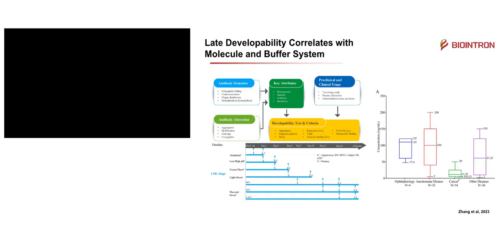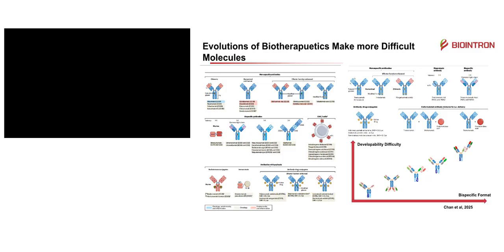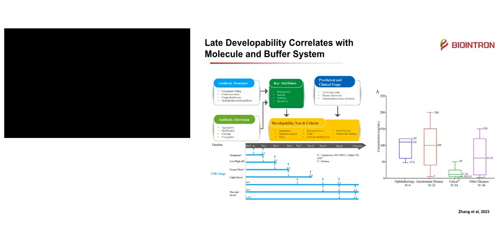That will be a simulation of the transportation and the storage. So that is an experiment looking for change, right? And if you look at this page, it is mostly talking about experiments looking for change, and that's very classical when we are talking about the monoclonal antibodies, and we have to perform all of them in order to have a very good pre-CMC package.